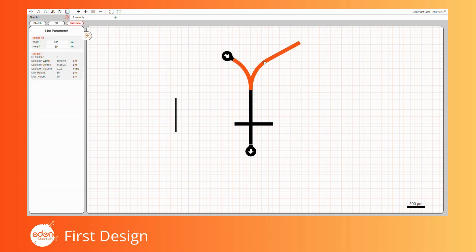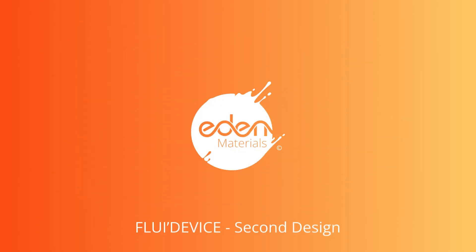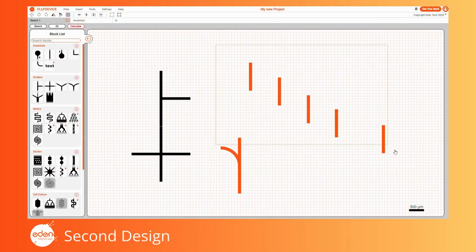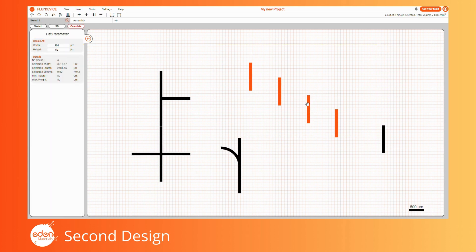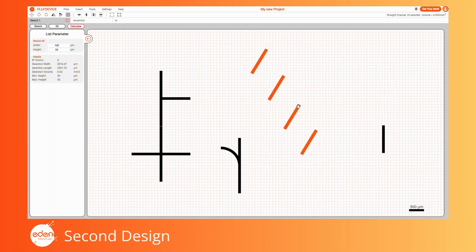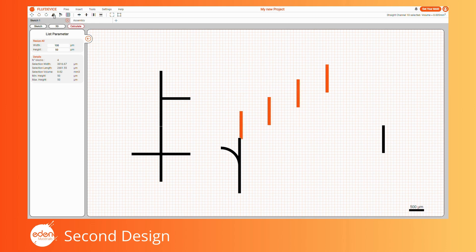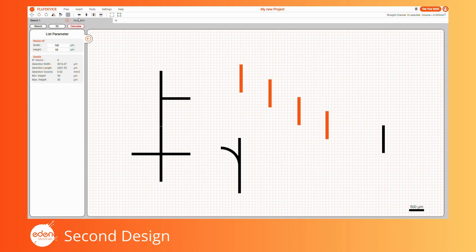You can select multiple blocks by holding the left mouse button on the grid and dragging a lasso around the desired blocks. Alternatively, you can click the target blocks while holding the Control button. Once multiple blocks are selected, the left menu is replaced by the list parameter menu, displaying information such as the total length, width, and volume of the selected blocks. You can move, rotate, mirror, copy-paste, and delete the selected block list similarly to a single block. Additionally, you can align selected blocks vertically and horizontally using the shortcut buttons or by selecting Tools > Align.